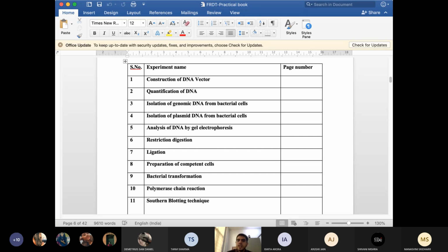So if instead of RNA you are having DNA, then that interference may be there, like you are having protein. These proteins may inhibit the action of your polymerases. Some proteases are there, and if the protease is there, they may lyse your polymerase. In that case, you might not get the amplification. So these impurities should not be there.